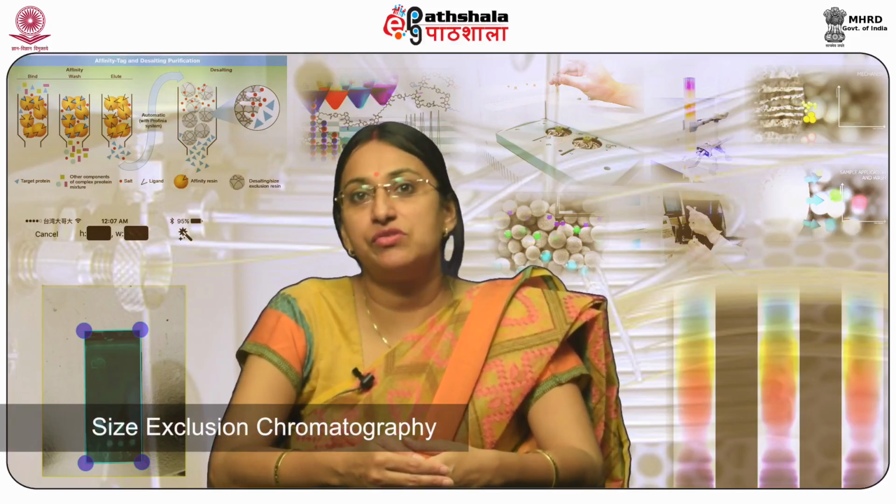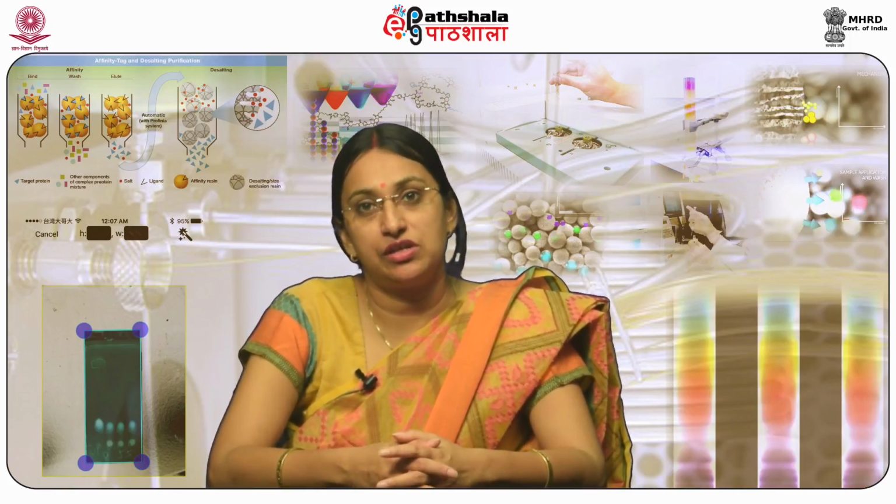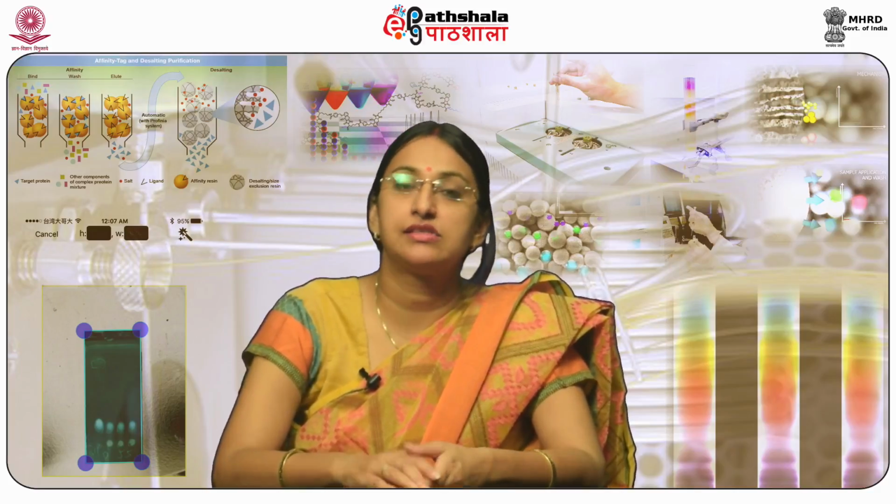For size exclusion chromatography, the mobile phase is selected on the basis of its potential to dissolve the components of the sample and maintain its consistent viscosity at operating temperature. Ionic strength of the solvent is maintained by addition of salts. Highly polar solvents such as water, alcohol, acetone, etc. are not used with polystyrene column packings.